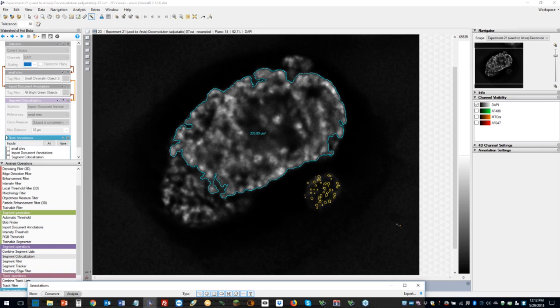I think one of the first things that I did a couple of years ago was I looked at data that was coming out of a very high throughput process. And I was interested to build a pipeline to measure histology artifacts, because I was curious about the performance of the histology over time. And so I did exactly something like this.